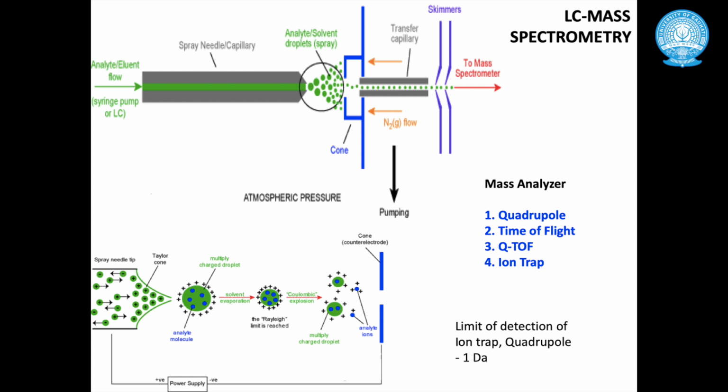But in the instrument which was used to get this mass spectrum, the figures after the decimal will not make much difference.